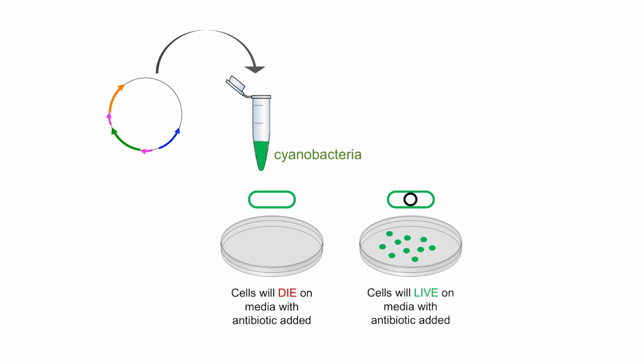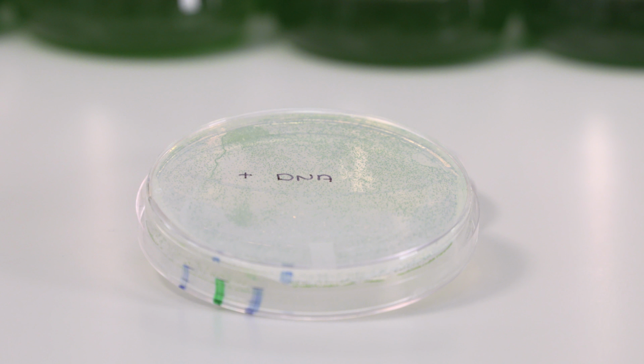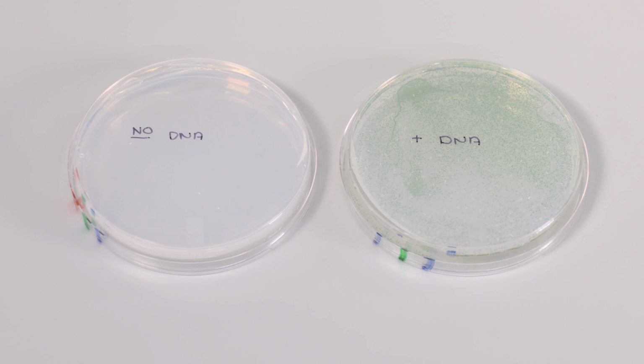Once we have the cells that contain the antibiotic resistance gene, and therefore the luciferase-luciferin construct, we will move them from a plate into our experimental setup. At this point, we may make other genetic modifications, such as decreasing or increasing expression of particular genes to observe how these alterations affect circadian expression of the luciferase reporter.